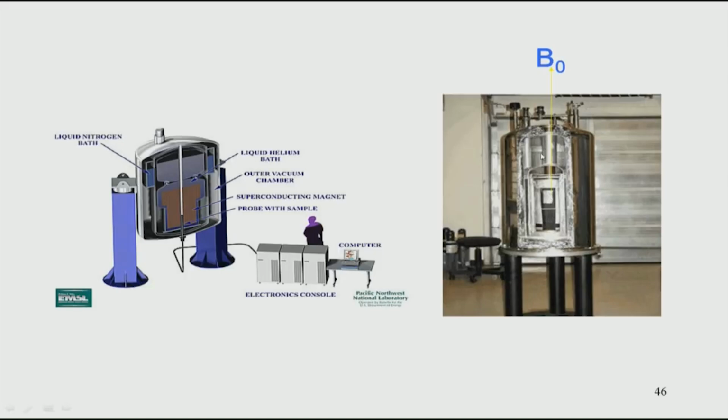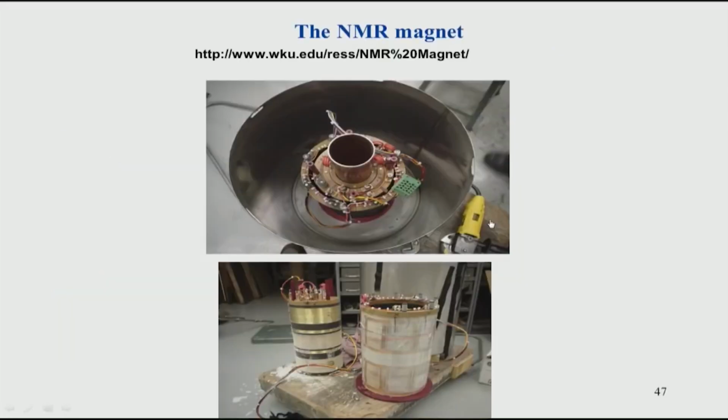If you see the interior, you can see different layers of the magnet, one inside the other. In the middle you can see the bore. This hole runs from the top of the magnet to the bottom, and you can see the coil surrounding this bore. We will look more closely at this coil in the next slide.